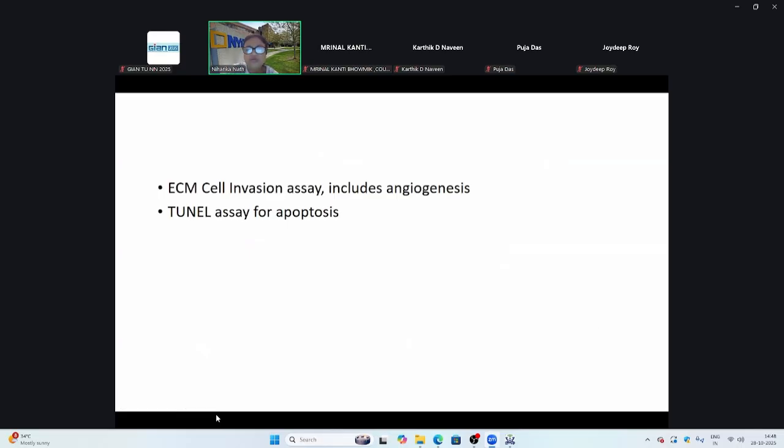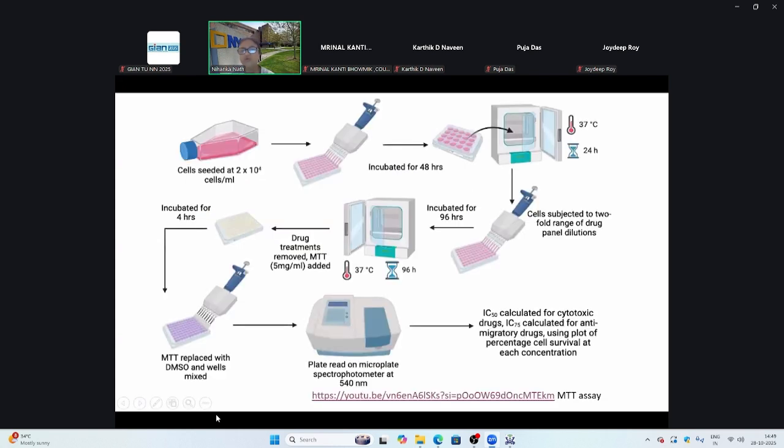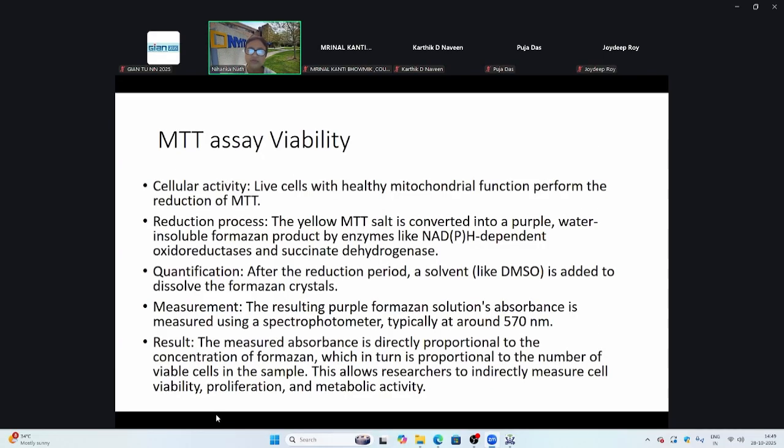what we did. What happens is that the OD that you get in here is just a measurement of the growth of the cells. And so that is cell viability. Cells are viable or they're not. Let's go to the next one.